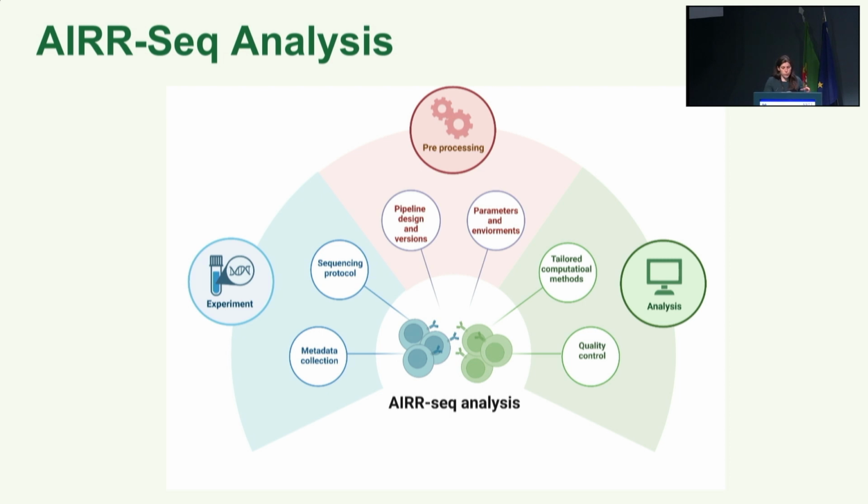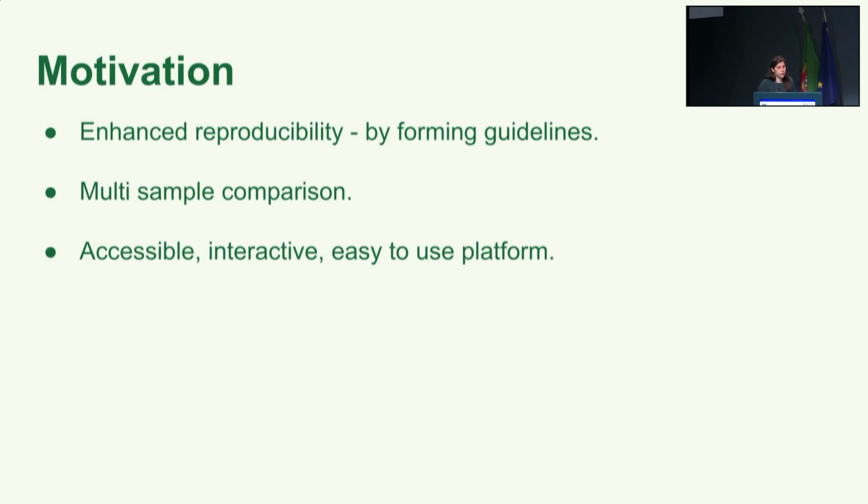Standardizing these protocols and creating very cohesive pipelines that can be reproduced and reanalyzed again and again is quite challenging, especially when there are a lot of tools in the environment and a lot of different run environments, parameters, and so on. So this led us to think about a few things: how we can enhance reproducibility in the world of AIRR-seq, and by this, we thought about forming guidelines.